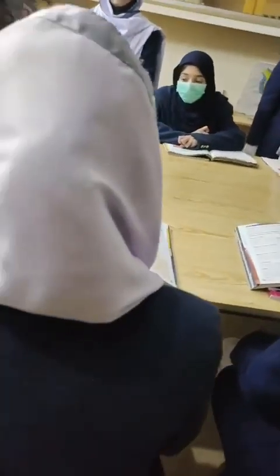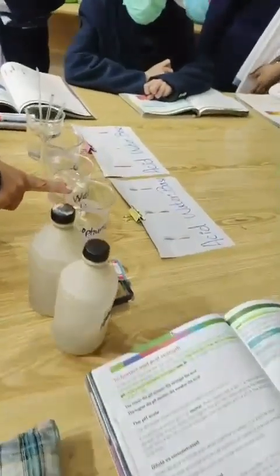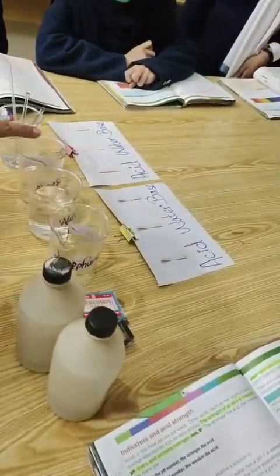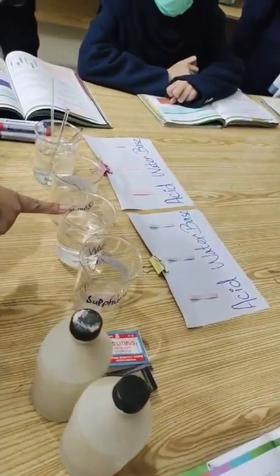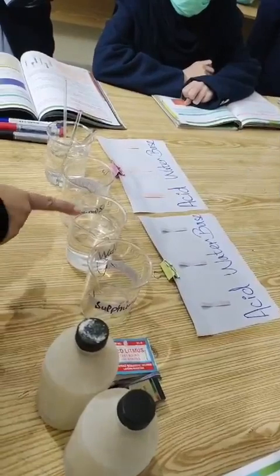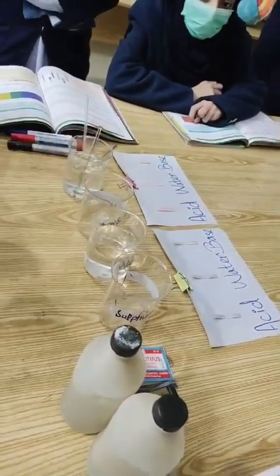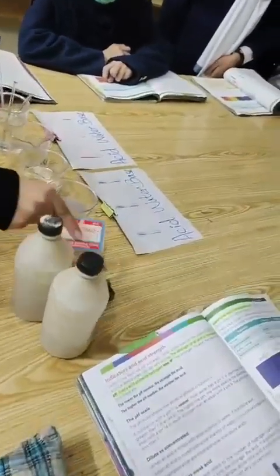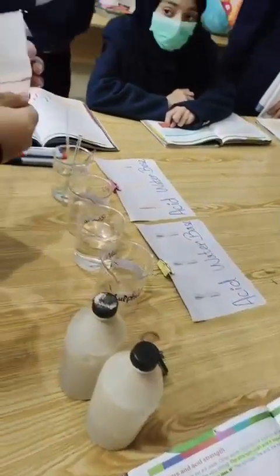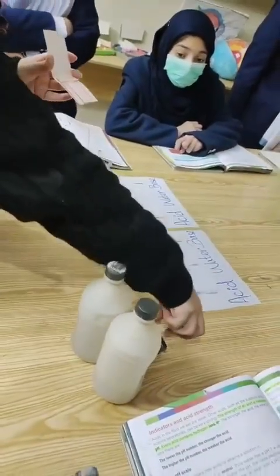You can see we have sulfuric acid H2SO4, base is sodium hydroxide NaOH, and water H2O. We have litmus paper as an indicator.